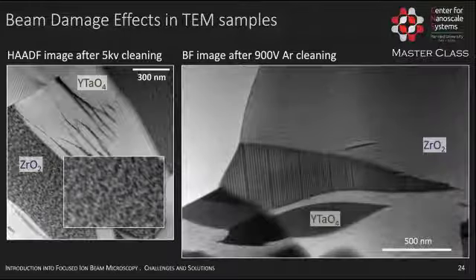So if we happen to have a very sensitive material in that zone, we can potentially damage the material so much that we actually lose information. That is very important. If you have material that is ion beam sensitive, and which has feature sizes on the order of the damage zone, you must also clean your cross-section with a low voltage beam.